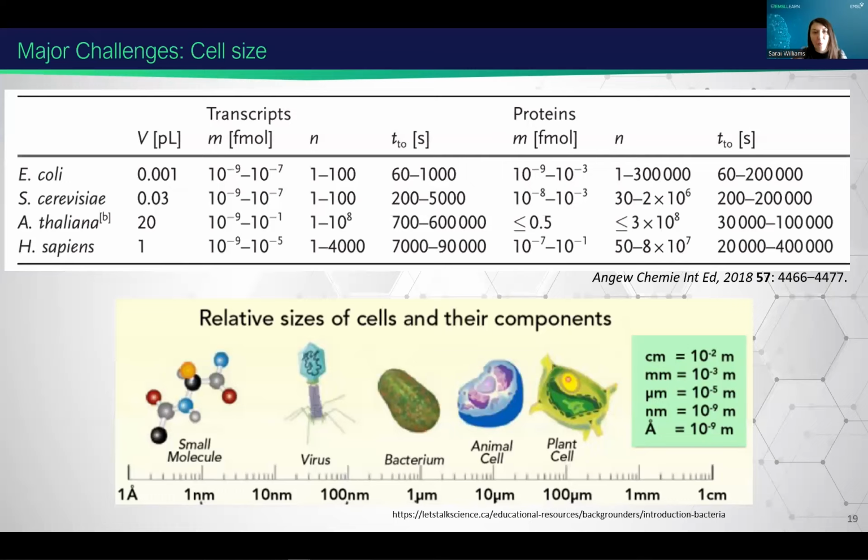We do have a well-established pipeline for mammalian cells. However, the cell sizes for mammalian cells are very different. You have the HeLa cell, which is starting material around 200 picograms, and then you have something much smaller like a lung tissue, which is 20 picograms. So that starting material really makes a huge difference.